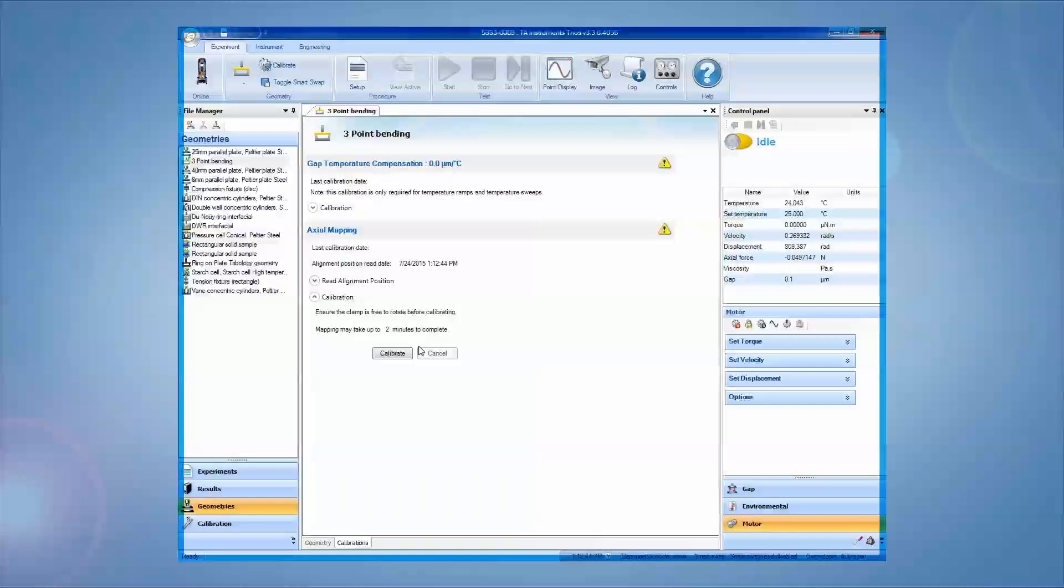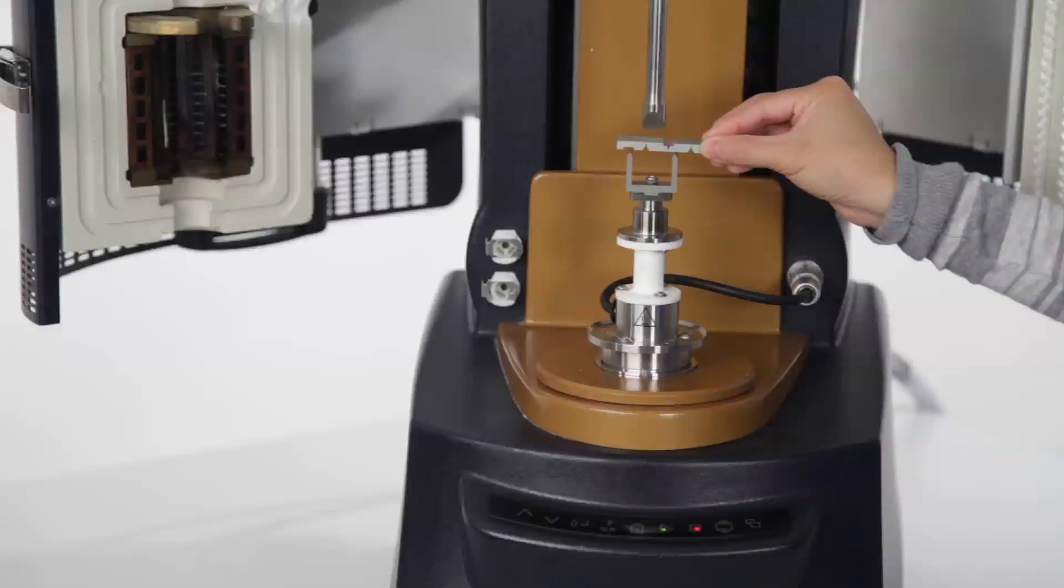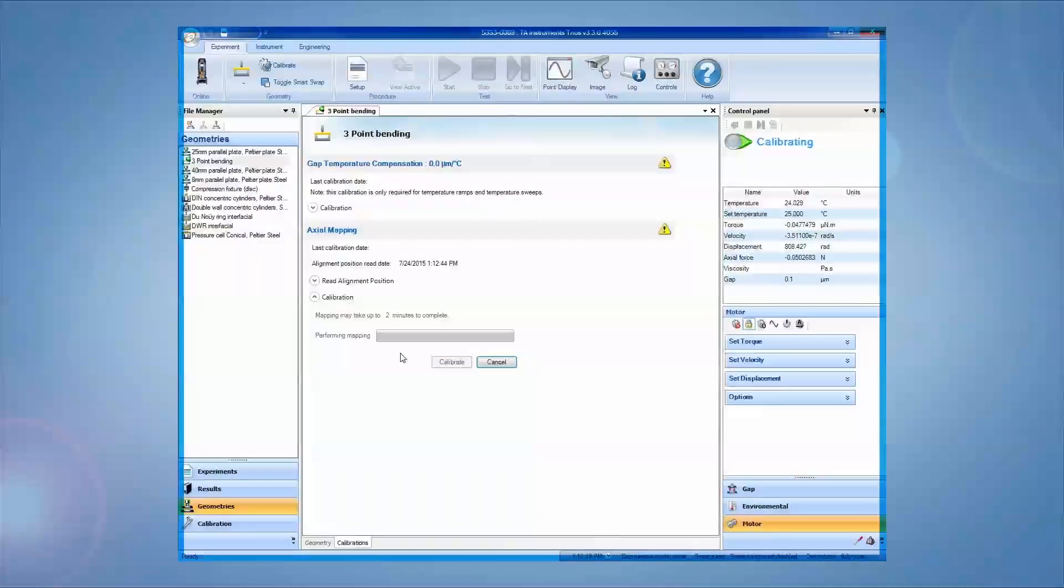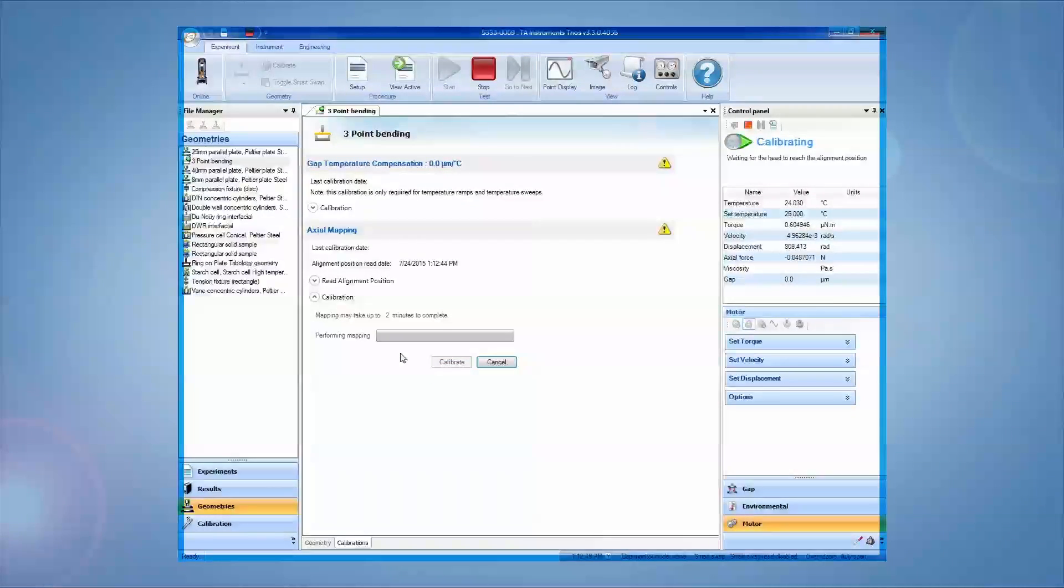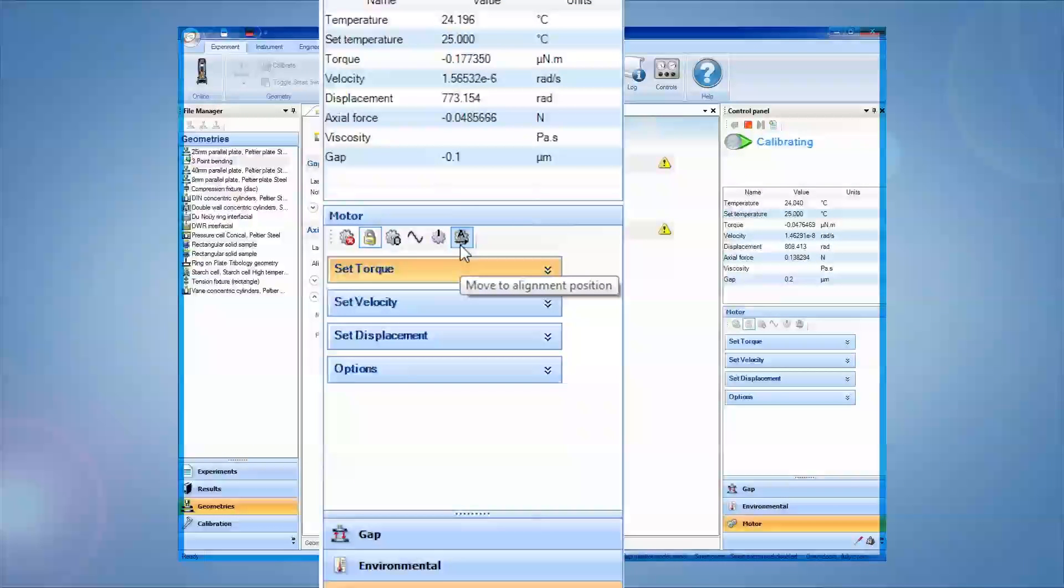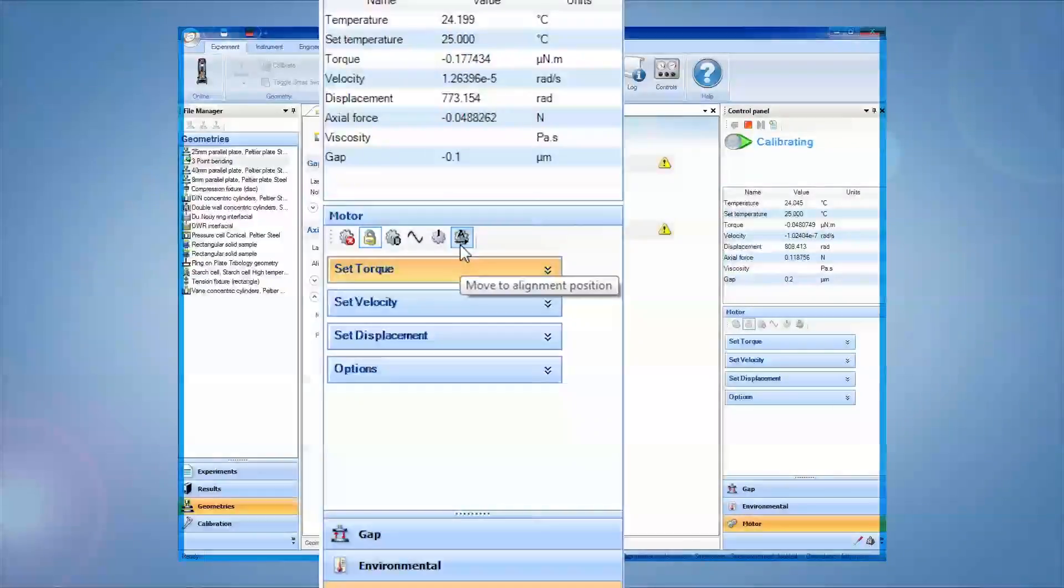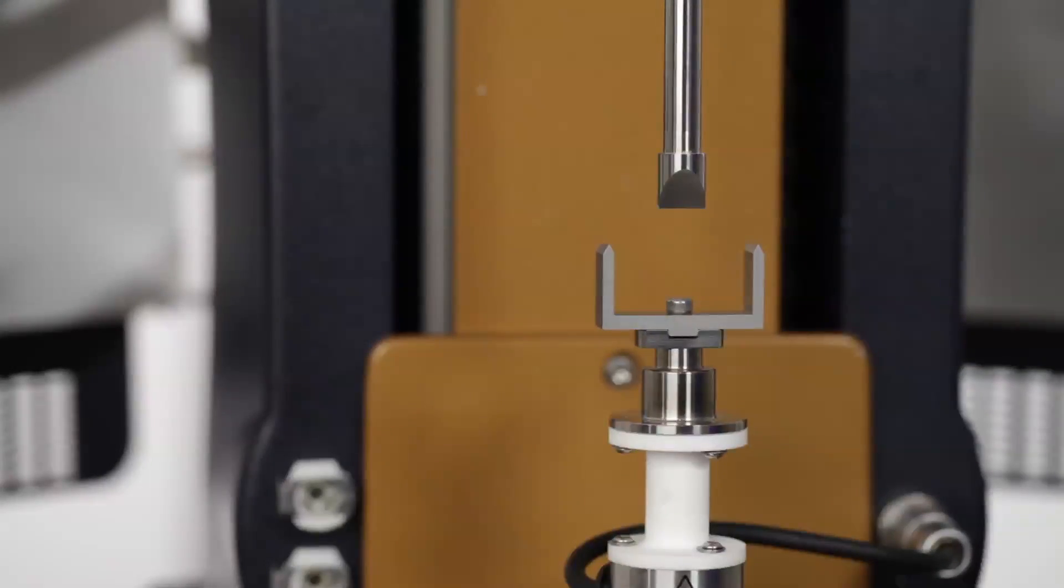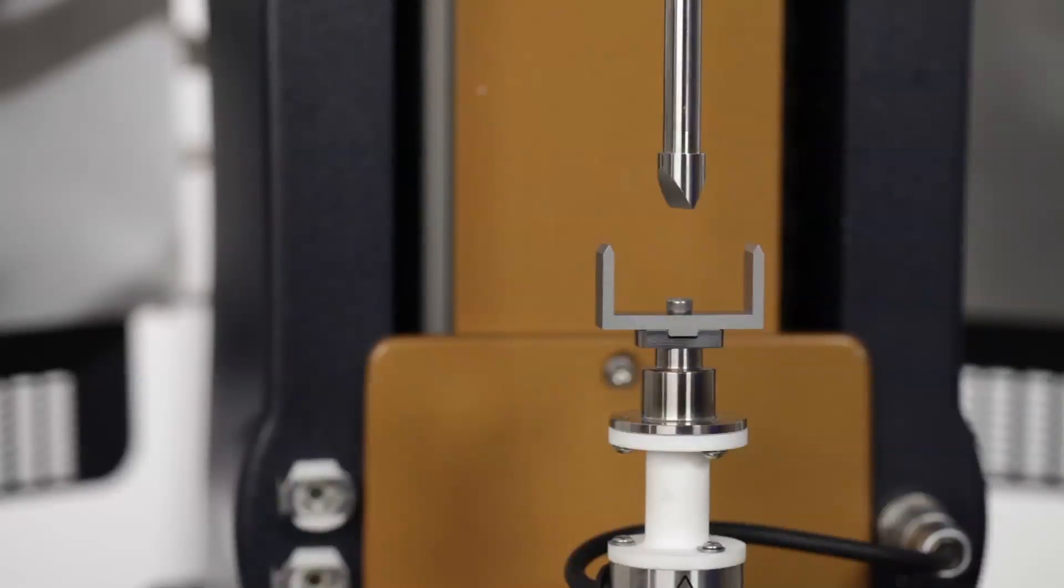Once finished, raise the head to remove the alignment tool and perform the axial mapping. You can now use the move to alignment position button in the motor control panel at any time to return the geometry to the alignment position. This guarantees the geometries are always aligned with one another during testing.